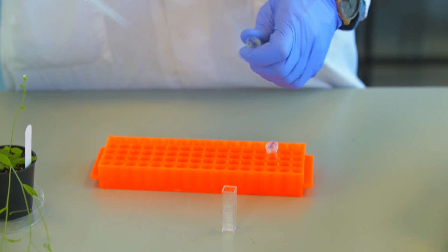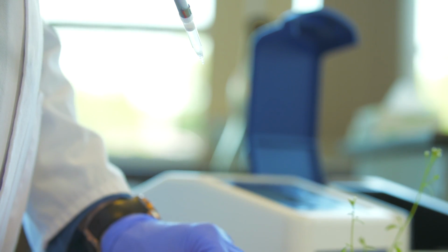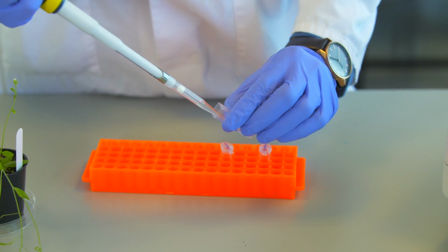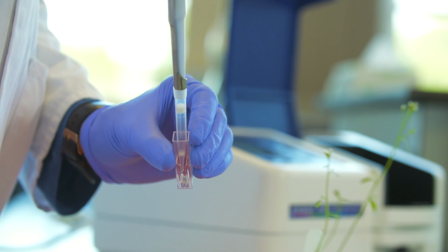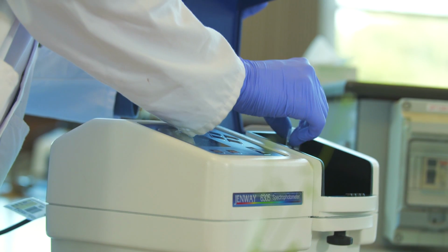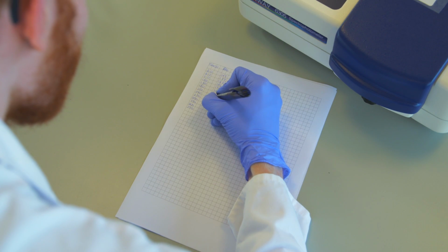To start the reaction, all I need to do is add a known volume of substrate solution to a known volume of enzyme solution in a squeaky clean cuvette, and then immediately start reading the absorbance at a particular wavelength. If I measure the absorbance at different time points, I can construct a standard curve from which I can then calculate the initial rate of reaction of my pyrophosphatase enzyme.